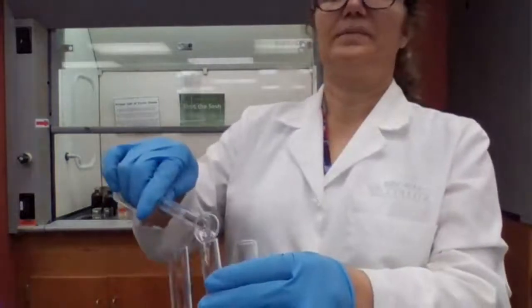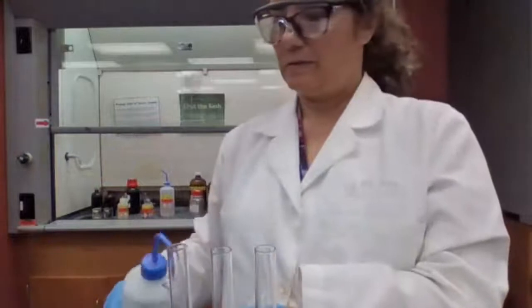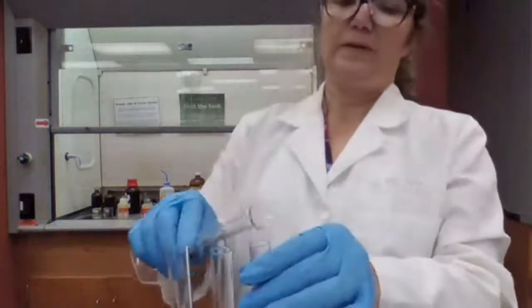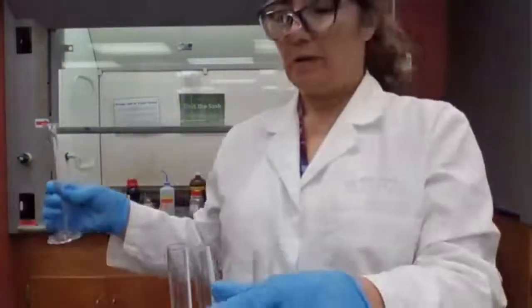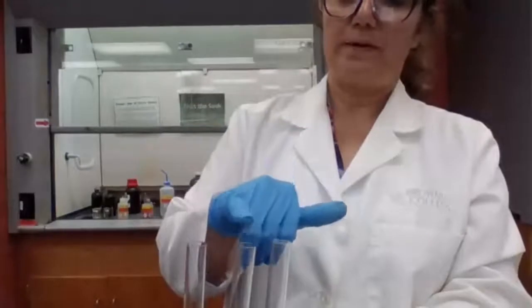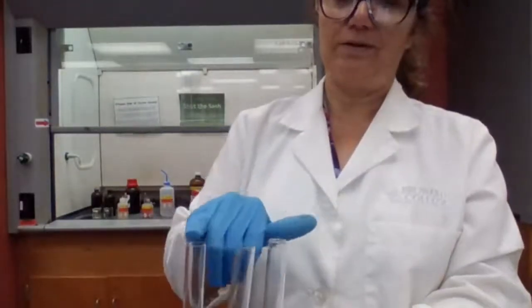Just letting you know the sample is okay, 0.2 milliliter, because my samples are all liquid. That's 5 milliliters of potassium hydroxide in 3 test tubes: primary, secondary, tertiary. Okay, primary, secondary, tertiary.